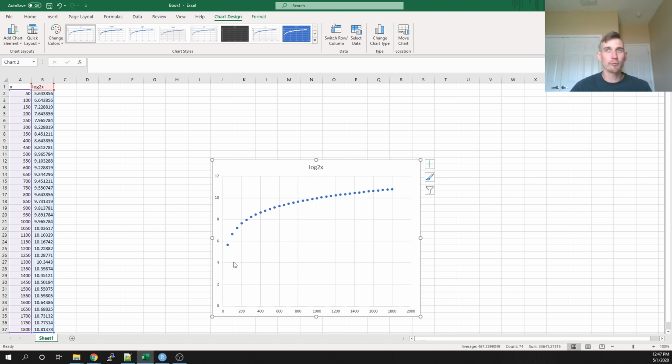So whenever we have such a wide range of expression values, we almost have to log transform them to be able to look at them or play around with them.